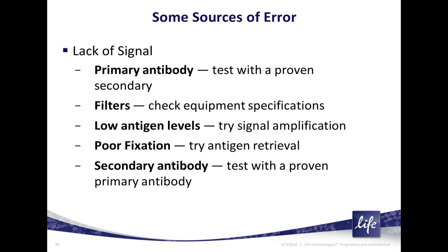Filters, you want to make sure that your filters are appropriate for your dye. We have an online tool called the Spectra Viewer. You can go there to check. You can enter your filter settings in it and compare it to dyes. So go to invitrogen.com, look under the Resources tab, and there will be a link for the Spectra Viewer. Other filter companies sometimes have some very good tools online. For instance, omegafilters.com. They have what they call the Curvomatic, which is a tool where you can enter their filter specs and compare it to different dyes.